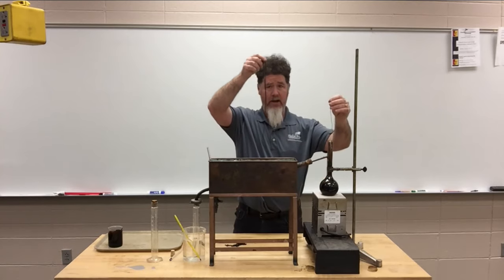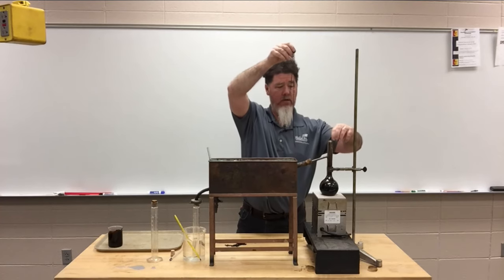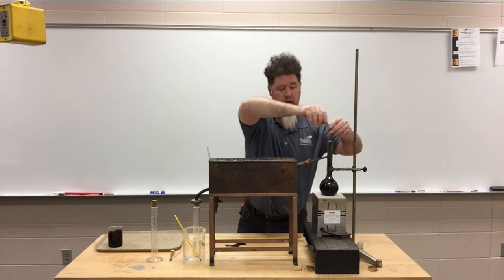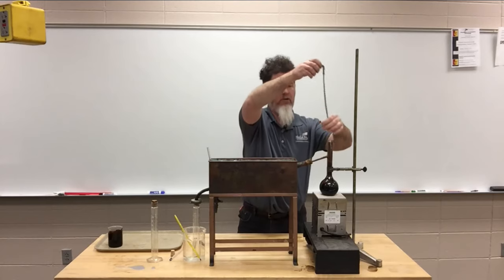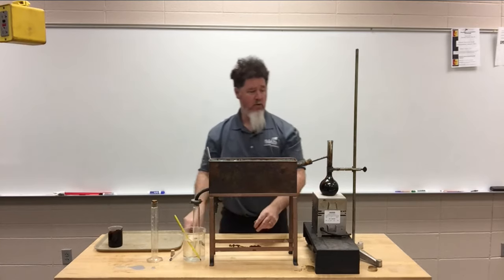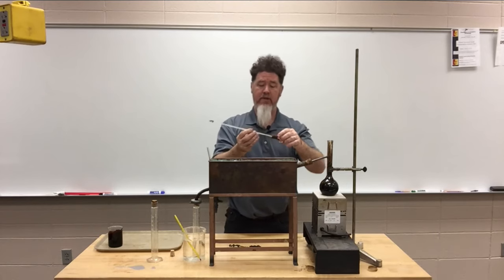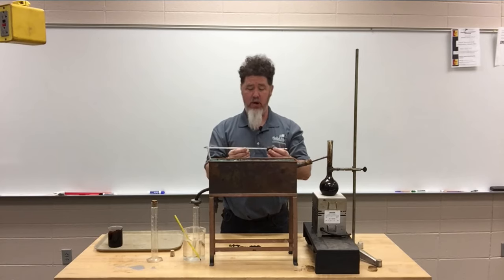Okay, I have a shorter chain I'm going to put in now. Again, that helps the vapors from the oil come up and helps condense. I may try to get two of them in there if I think they'll fit. Nope, only one is going to fit. The reason I can't go up too far is because I need to put a thermometer in there. My thermometer goes all the way up to 700 degrees, because that's what the temperature of the oil could be as we're boiling it.